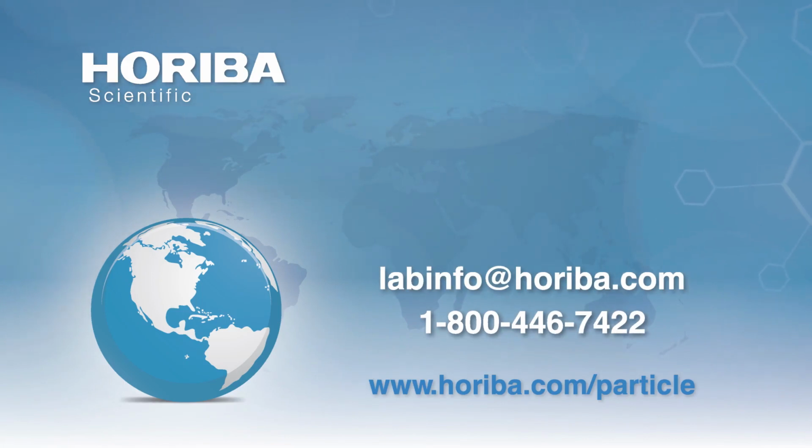And that goes for any substrate, whether it be, like I said, a sugar sphere in the case of the work done today, and the sugarlets, or an MCC sphere or other type of sphere. So it really comes down to your starting particle quality attributes that you really want to be concerned about, not only during development, but at each stage of development through scale up, and then throughout the life cycle of the product during commercialization. And other quality attributes, of course, for other ingredients within your formulation. For me personally, I like to keep the formulation fairly simple. The simpler, the better, and to ensure that robustness and consistent performance.